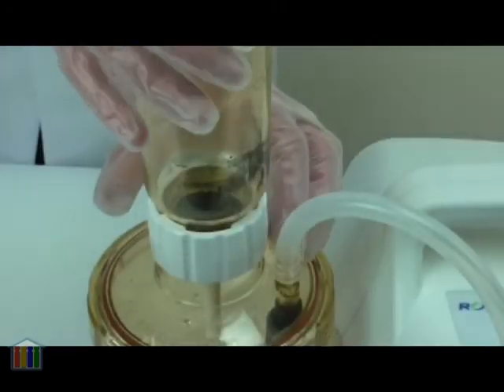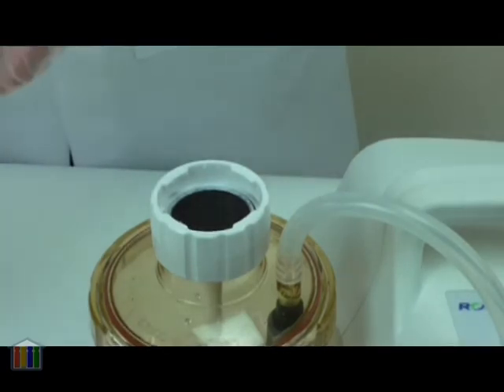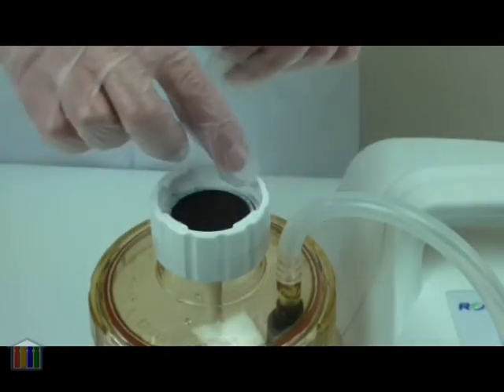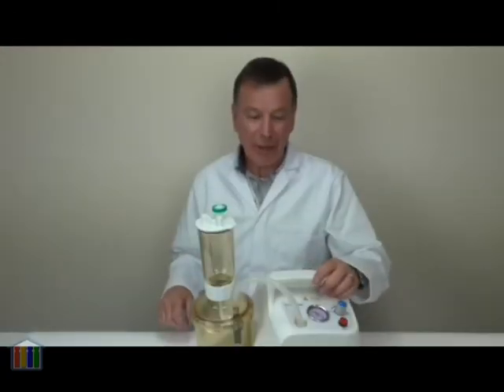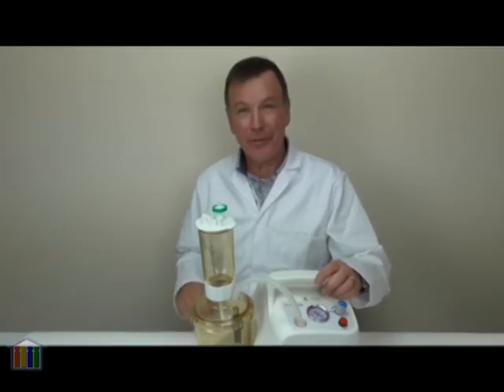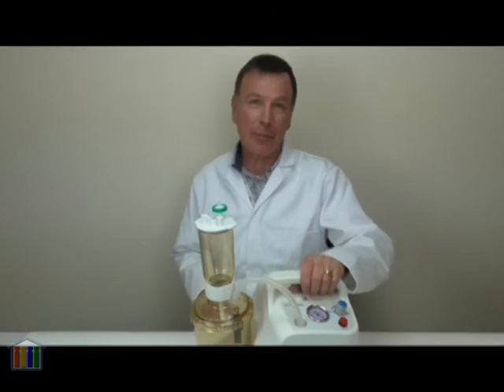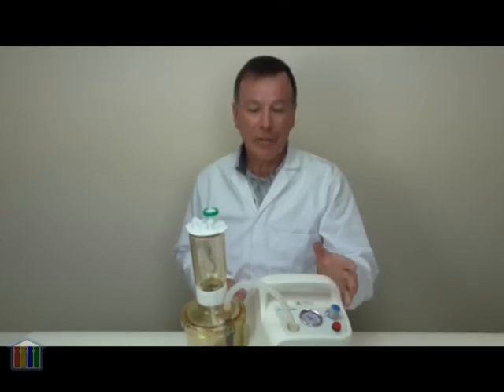When I disassemble the reservoir from the top just half a turn and unscrew it, you can see on the filter membrane all of the residue left behind. Most vacuum filtration systems either use water which is extremely wasteful or a separate vacuum pump. The LAFIL 400 as you've seen is both simple to use, easy to move around the laboratory and extremely versatile — an ideal solution for your laboratory filtration requirements.